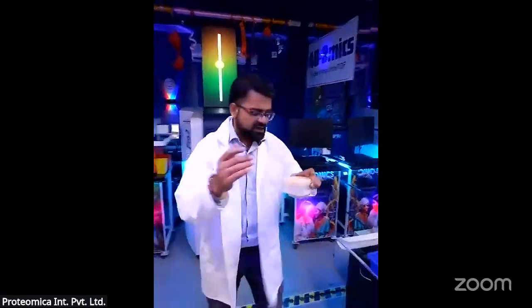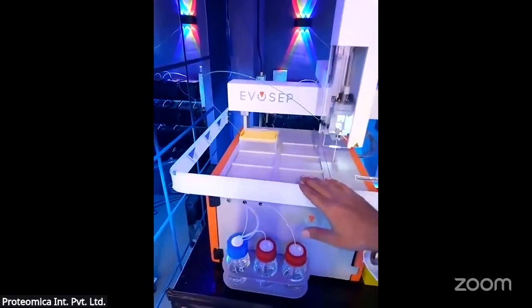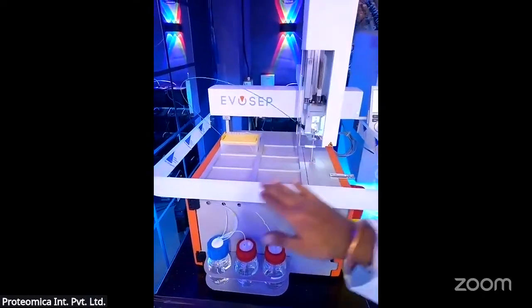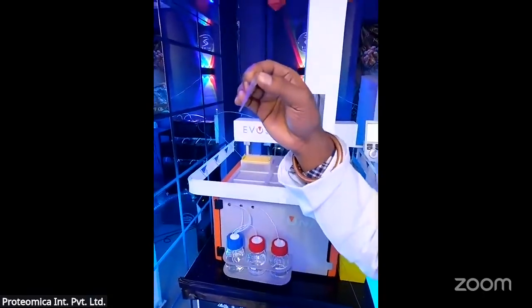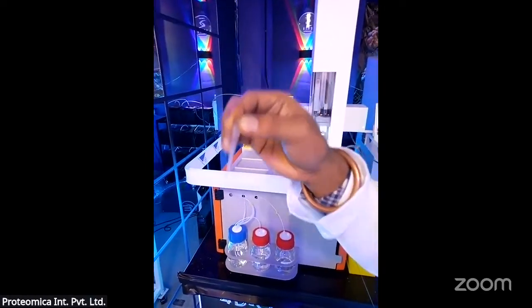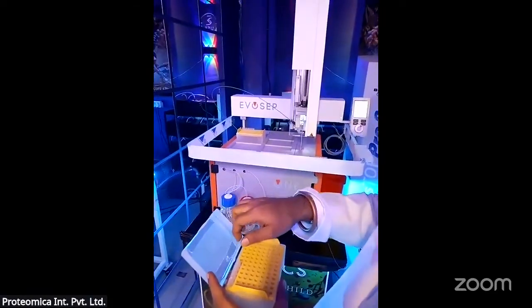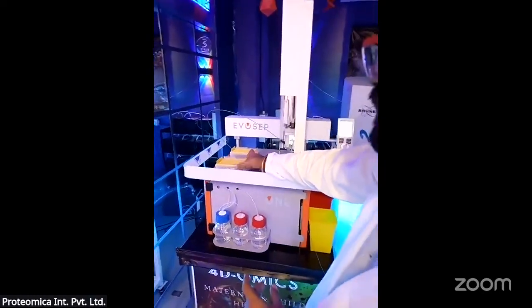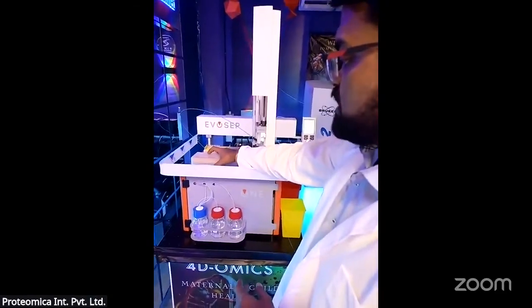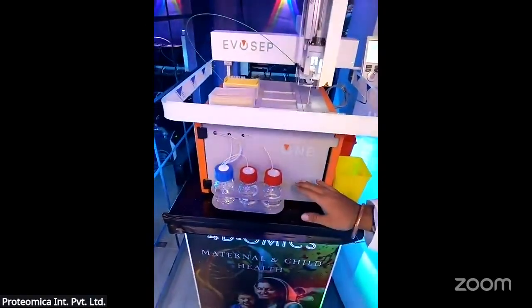So you can find this is the cutting-edge nano LC, the Evosep nano LC. And you can find there are no sample collection vials. There is C18 material in these cartridges; these are proprietary tips. You directly take a tip, put your sample inside, and place it in one of the matrices for this kind of activity. Once placed, you can directly open it. There is a syringe from where it takes the sample and directly injects it. It also has 3 reservoirs.